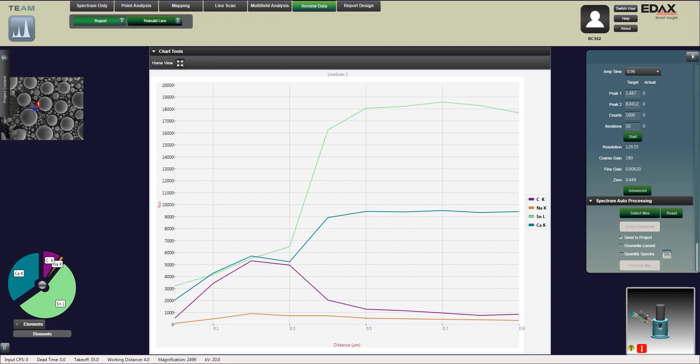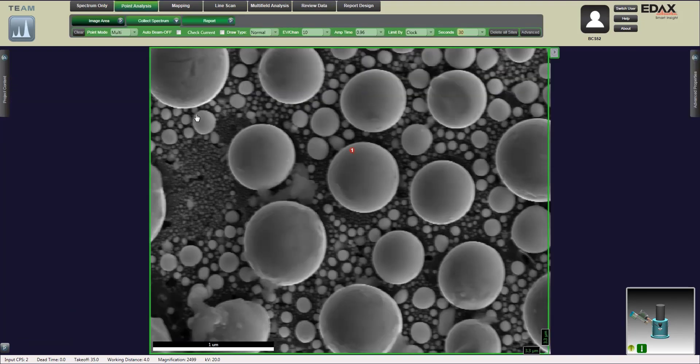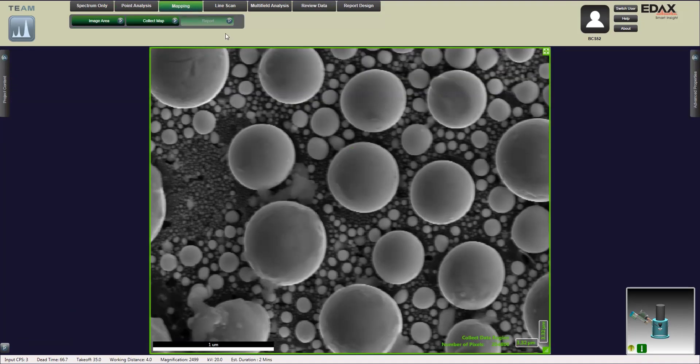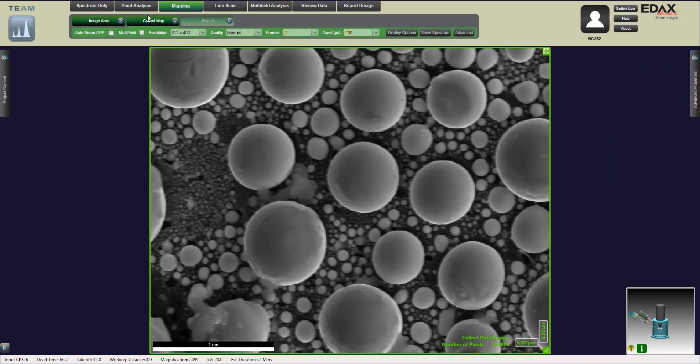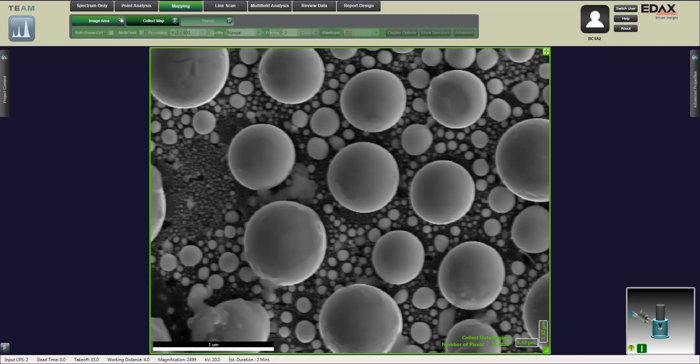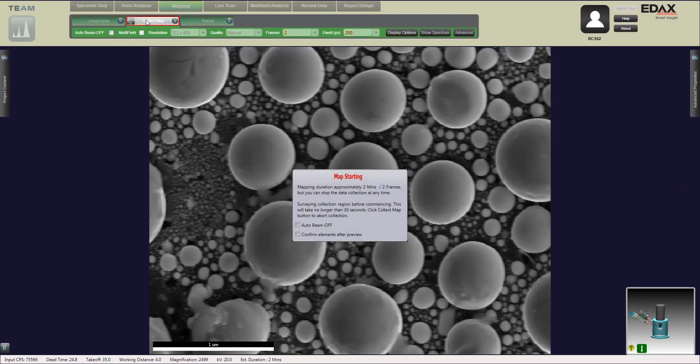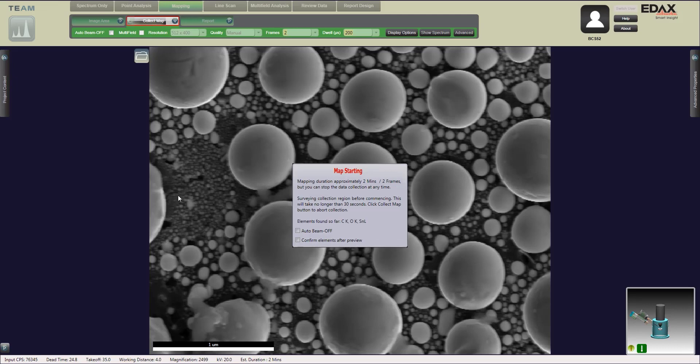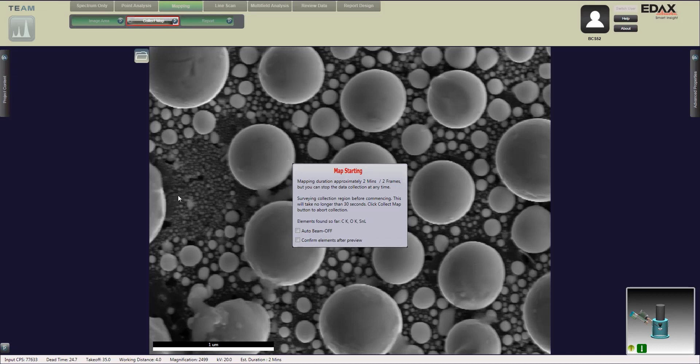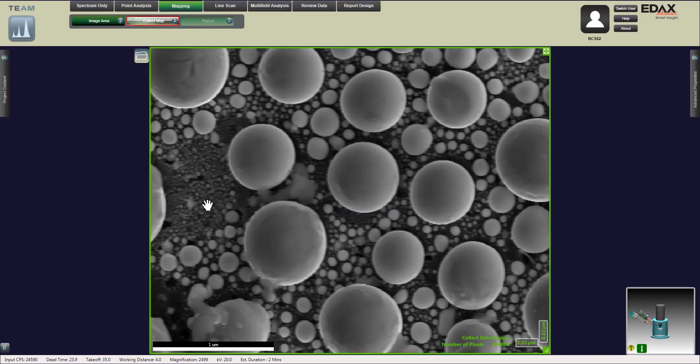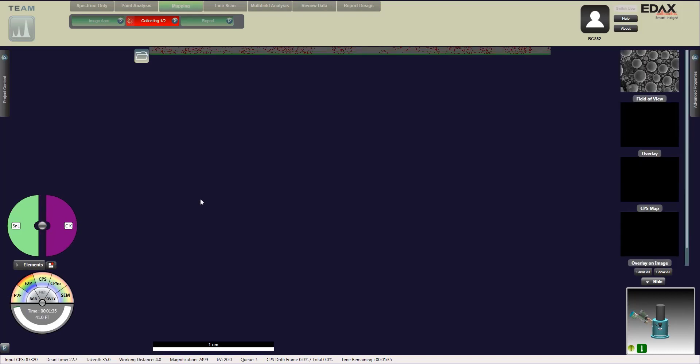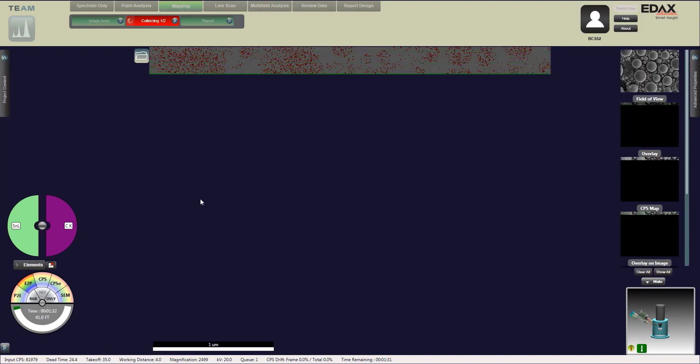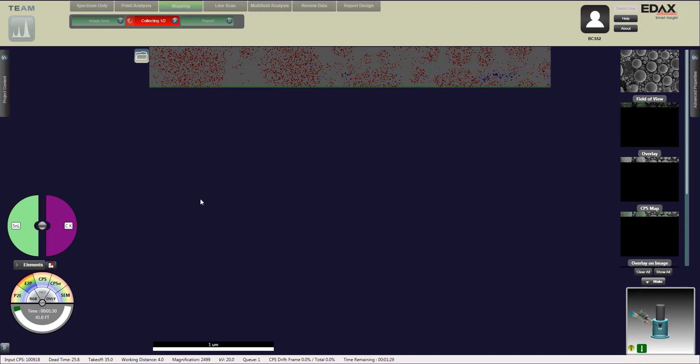Now we're going to review mapping. We select our mapping and we're collecting the map and it will tell you a time how long it's going to take. This is just set for two frames as an example but you're probably going to want to run more frames than this. Now it's collecting and what we're seeing now is a phase identification map. It'll try to create phases between the elements that it finds in the scan and populate it with this.